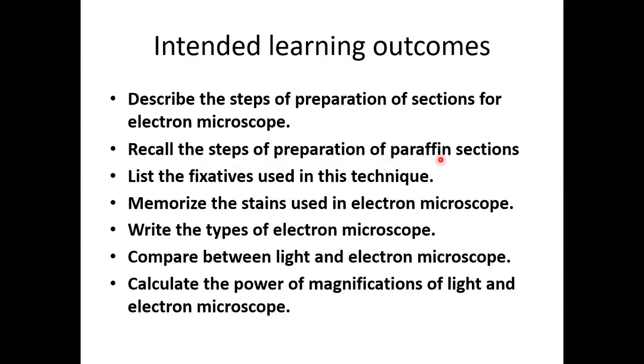To recall the steps of preparation for paraffin, and we will try to remember them as usual.